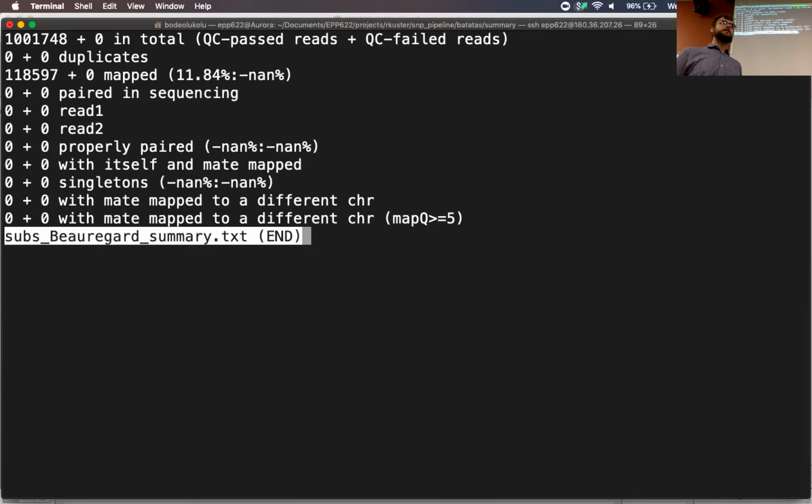You're only doing chromosome 15, for obvious reasons. And the reads that we're trying to map to chromosome 15, think of them as being randomly drawn from the actual genome. Considering chromosome 15 should be one of the smaller chromosomes, what proportion would you expect to map to chromosome 15?